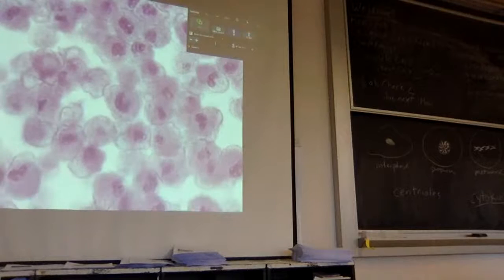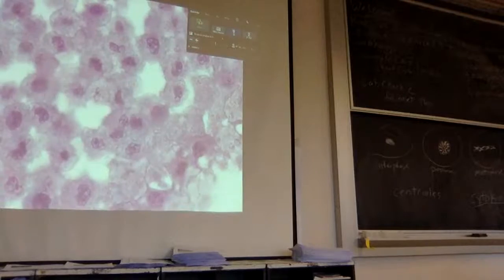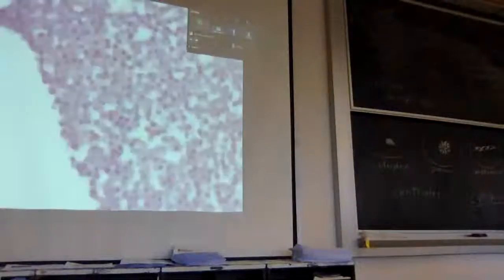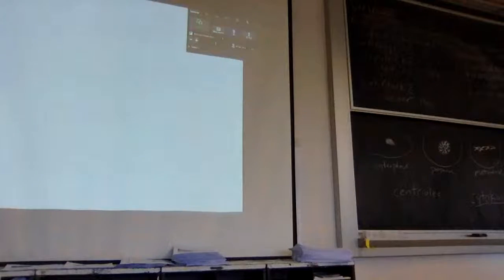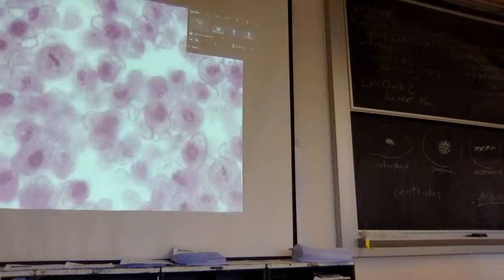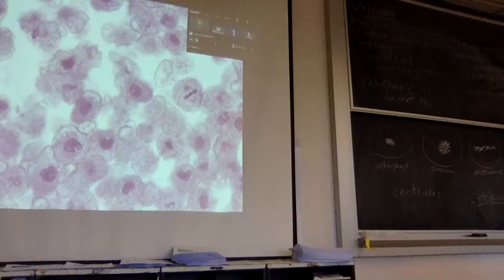So once again, you can see how much trouble I'm having. It's going to take some patience on your part to find one that matches. Let me go to a different embryo. Here we go. Let's try this one. You have 9 of them to choose from, so if one doesn't work out, move to the next one. More metaphase over here.